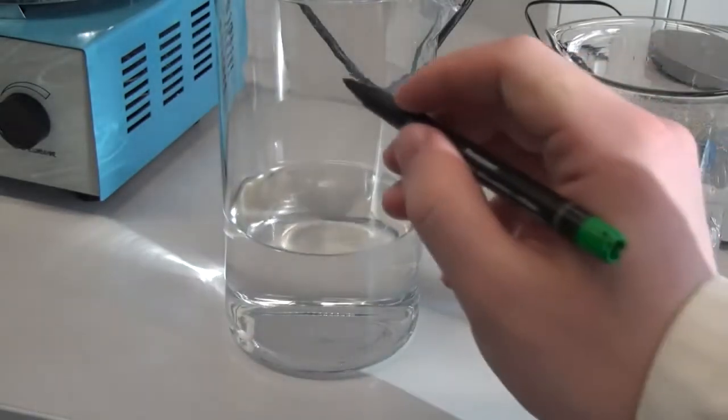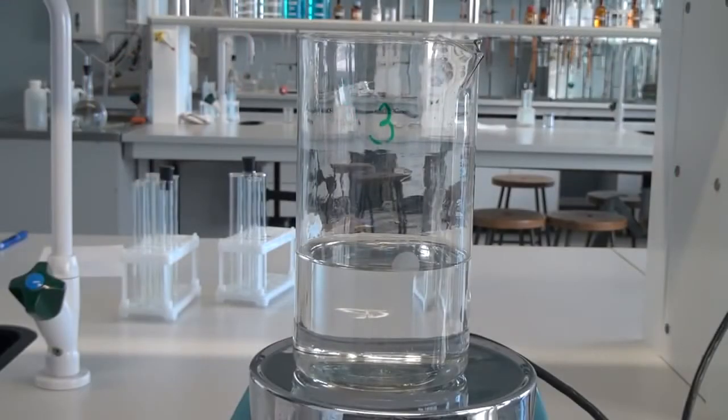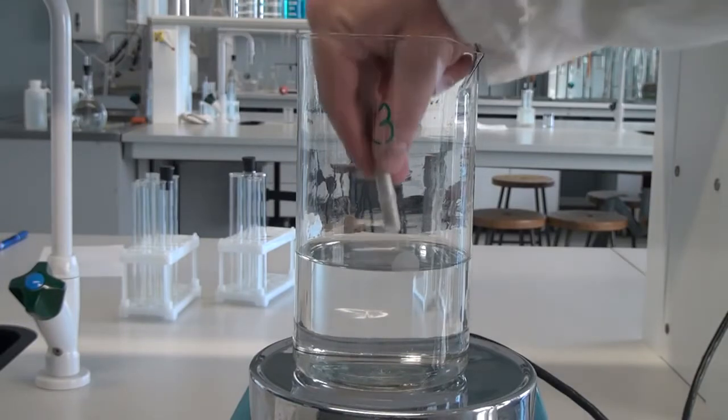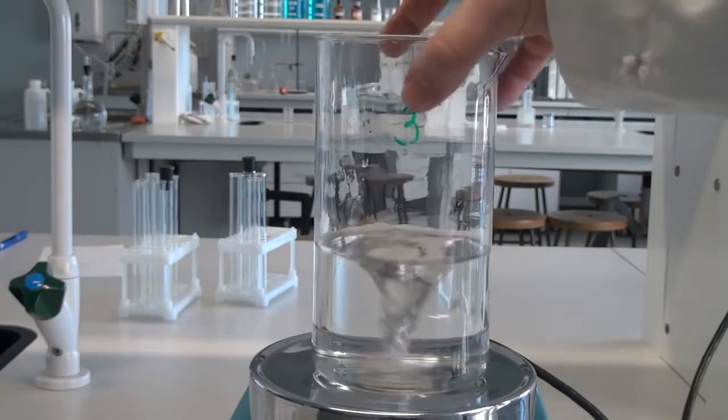And now we have all three solutions ready. Now the most important thing — conducting the reaction. The reaction needs to be carried out with a magnetic stirrer. Take the glass with the third solution, put it on a magnetic stirrer, and turn on mixing.